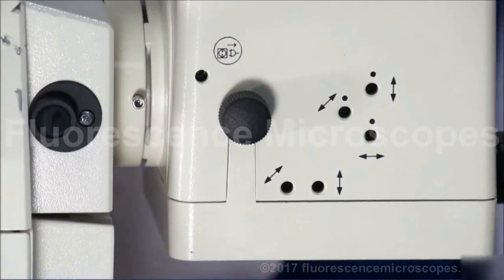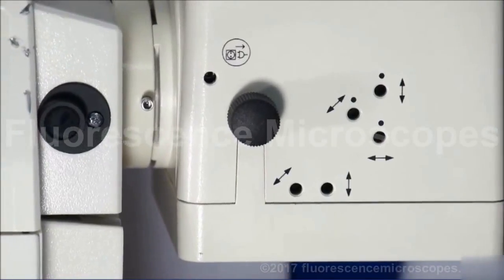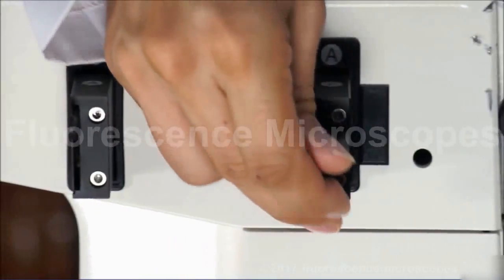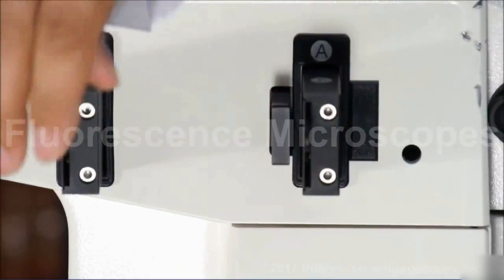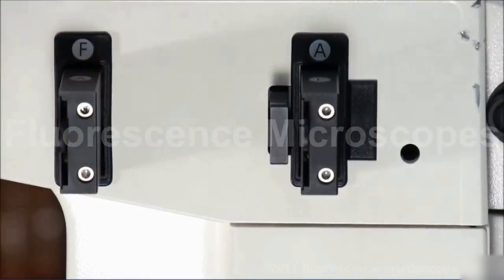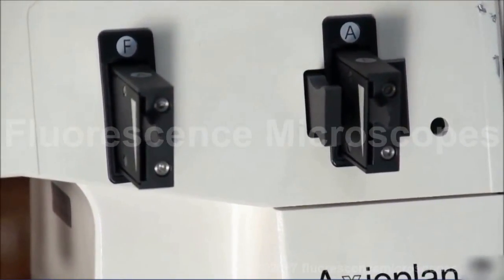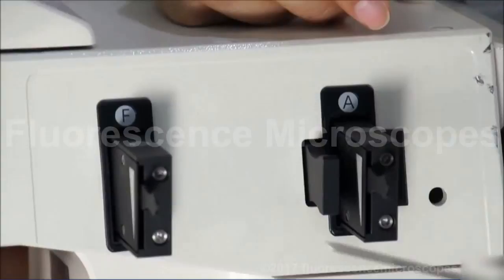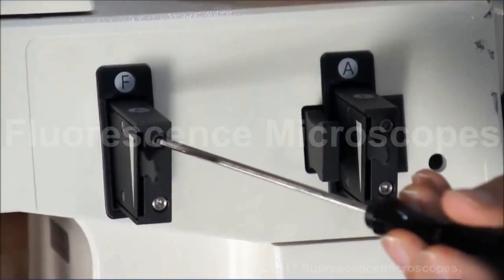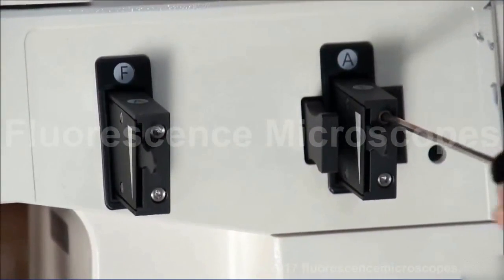We also have an aperture and a field stop iris diaphragm. This is how you control the iris on it. And here's your centering. They each have centering knobs, 3mm hex.